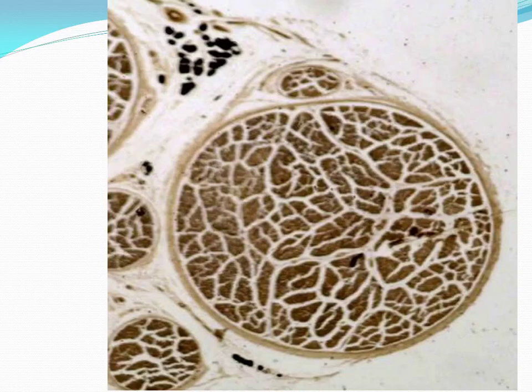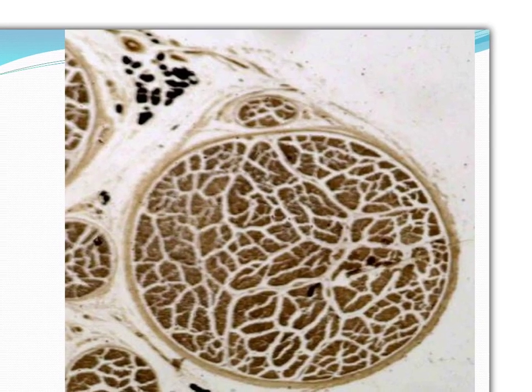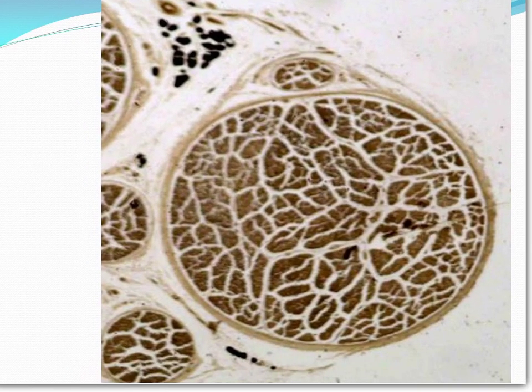The same picture but much more magnified. You can see here that we have these bundles of nerve fibers surrounded by the perineurium. On the surface we have epineurium. They are stained non-specifically; they should take some color. And here inside the bundle you can see this whitish area representing the endoneurium. And these are fat cells full of fat stained black by this osmic acid.